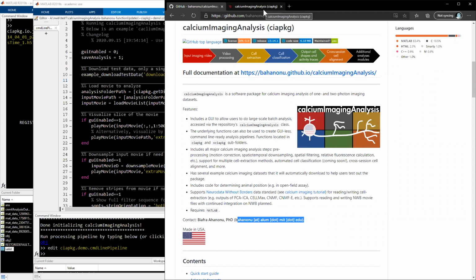Thanks again, and I really enjoyed what's being pushed with NWB. This hopefully should make a lot of the provenance issues, and actually getting old data from people and reprocessing it, easier. For example, for an automated cell extraction, I had to collect data from many different people, and you realize very quickly that if there was a data standard 10 years ago, you would have been saved a lot of hair pulling and figuring out even what frame rate a movie was taken at.